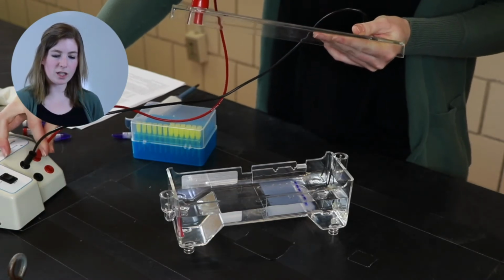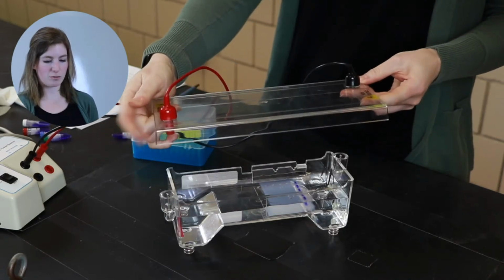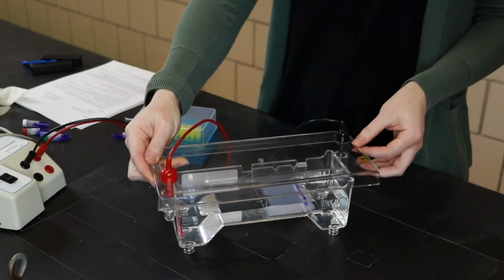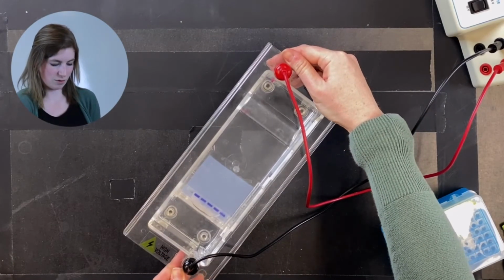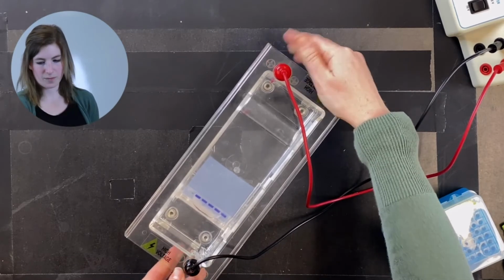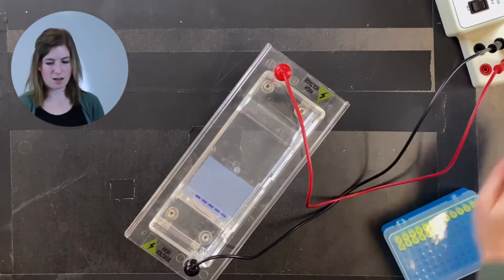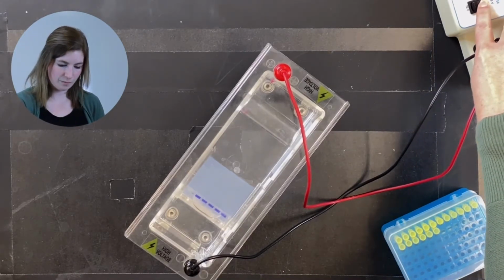And I'm going to put the lid onto my box. And I want to make sure that I match the red up with the red that's on my box here and the black with the black. Definitely don't want to mix our positive and negative electrodes. Once I have this on, I'm just going to make sure everything looks like it's set, and I'm going to turn my power source on to 125 volts.